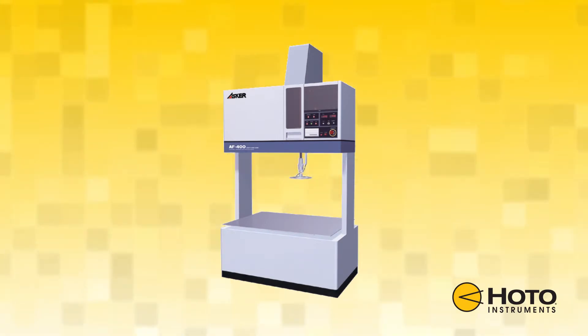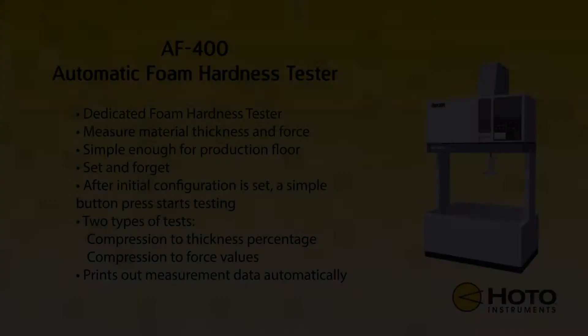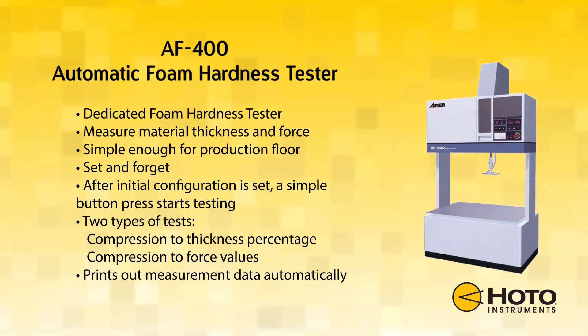Introducing the AF400 Automatic Foam Hardness Tester. The AF400 is a dedicated foam hardness tester that measures material thickness and force applied to the test sample.